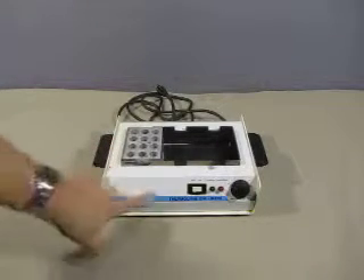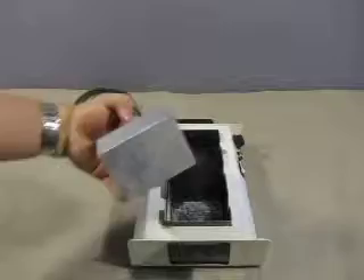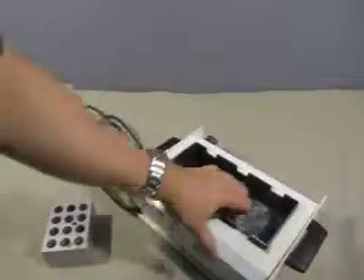There is some tape here, and the paint is starting to chip here. You get this metal block — it's for holding specimens probably. The bath itself has some water in here, and some water damage.